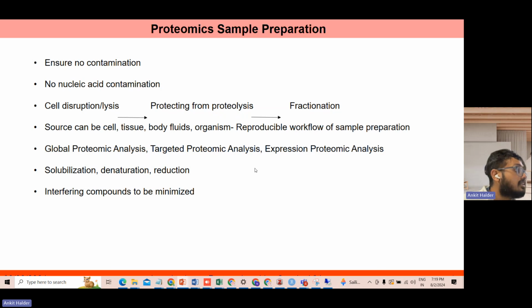Not only particular lipids or nucleic acids or other reagents, like the waste products, saps, tannins, alkaloids, etc., but sometimes the salt concentration remains quite high, for example in cerebrospinal fluid, because those serve a different purpose in the organism.